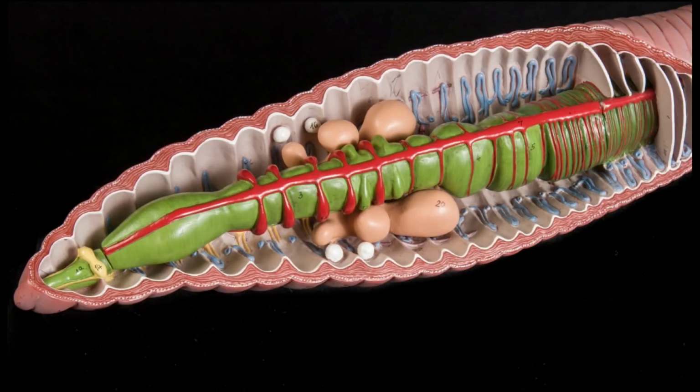Several other structures are visible in this view. At the anterior end of the earthworm, sitting atop the digestive tube, are a pair of suprapharyngeal ganglia. A ganglion is a mass of nerve cell bodies and fibers. The suprapharyngeal ganglia are the earthworm's brain, such as it is. Next, we have the dorsal blood vessel, sitting atop the digestive tube. This vessel carries blood towards the heart, as we will discuss shortly.